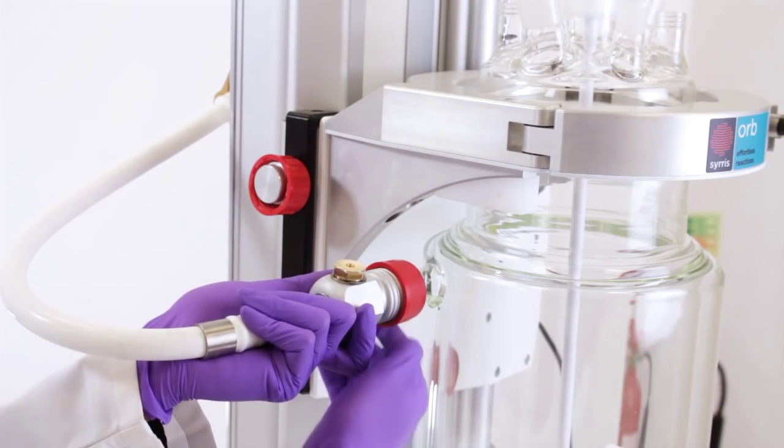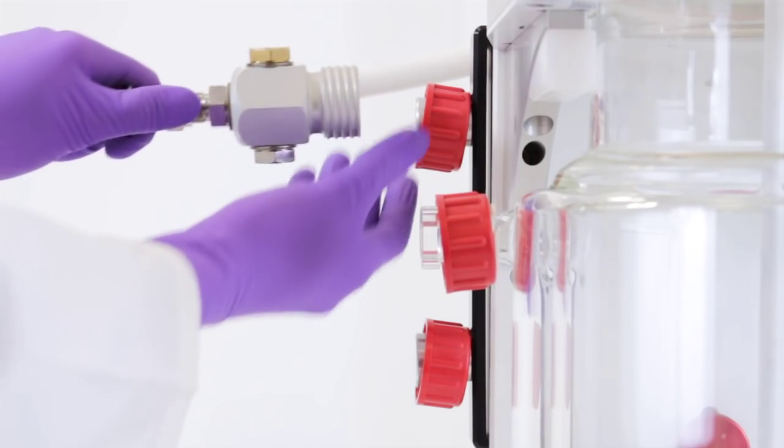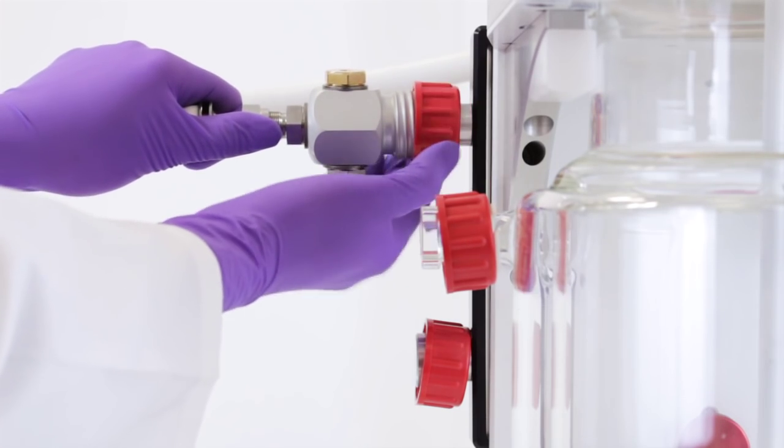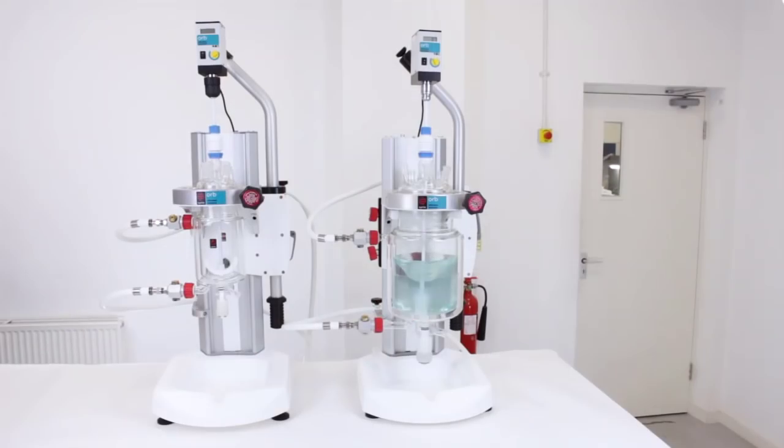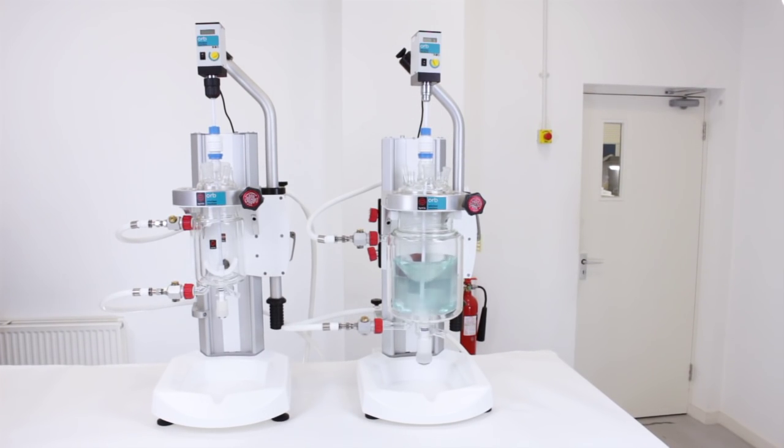Changing vessels on Orb is easy. Orb allows quick and reliable connections of the oil pipes to the jacketed reactor without the need for tools. The stirrer motor can be easily lifted and rotated out of the way for vessel changes.